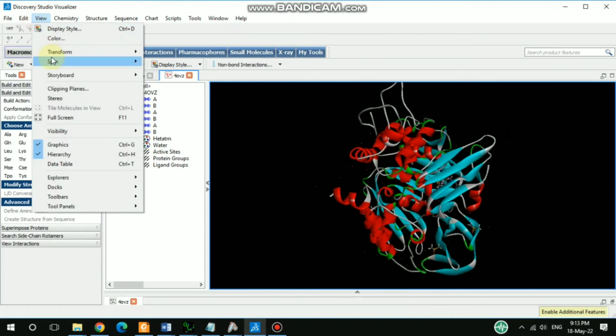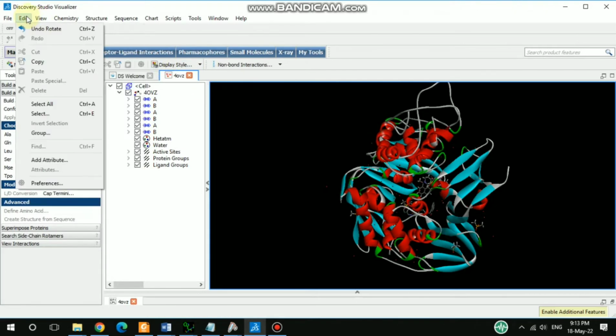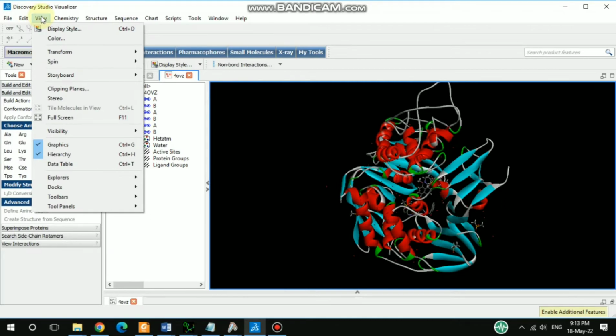So this is, you can turn it off. So this is, turn it off. So now I'm going to show you the active side as well also.